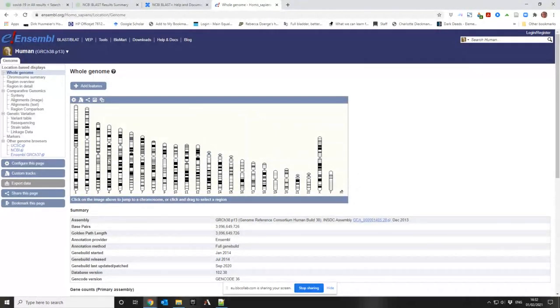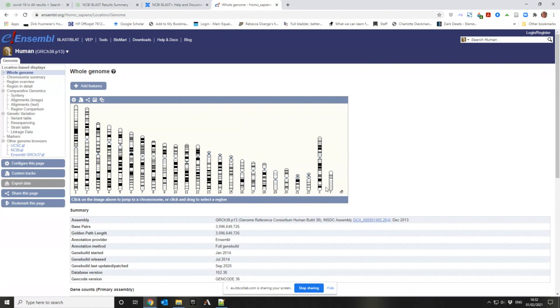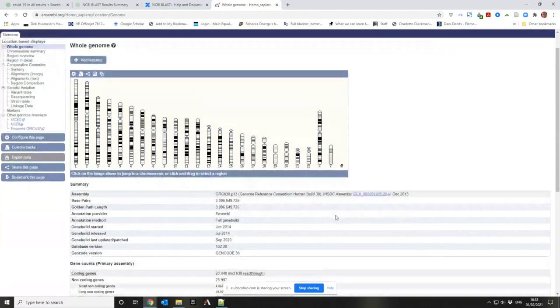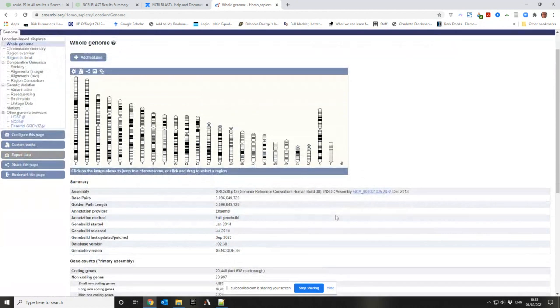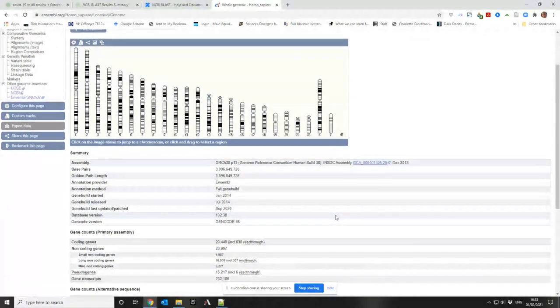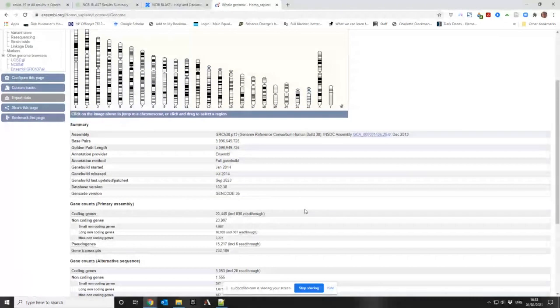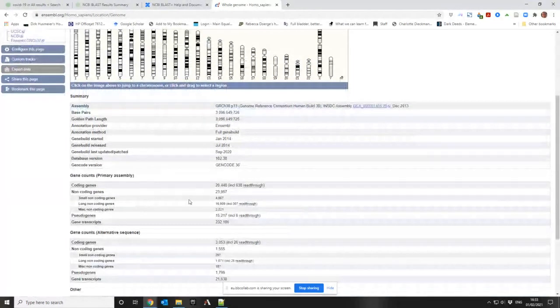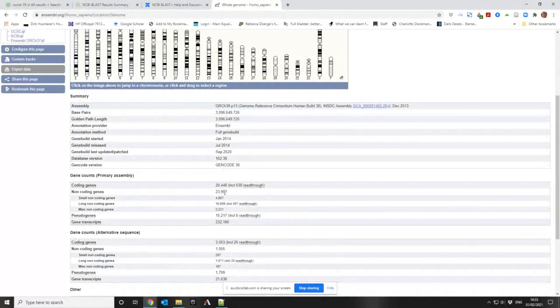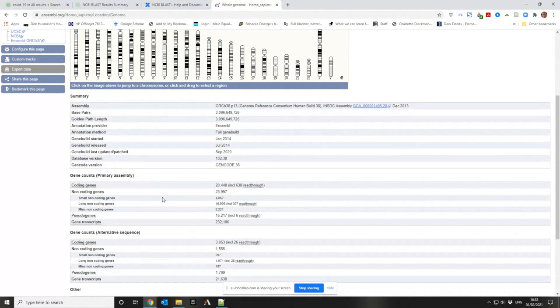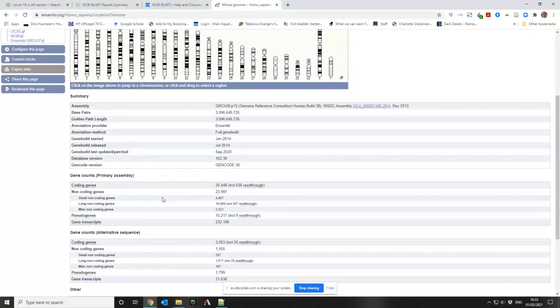What it does is it aligns up all of the chromosomes for the human genome and then you can click on them and explore. Down here's MT for the mitochondrial genome. This build is from 2014 but it was slightly updated in 2020. There are 20,448 coding genes.